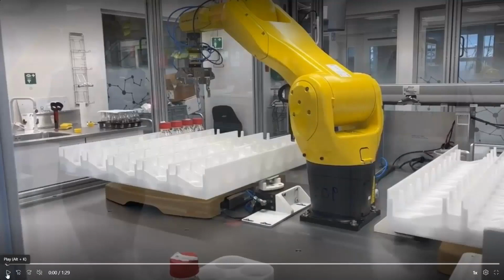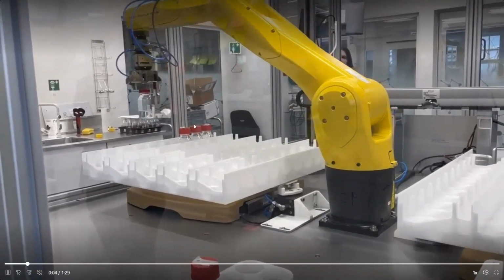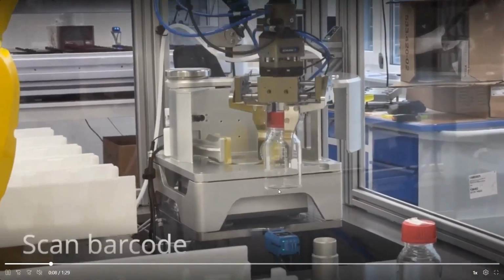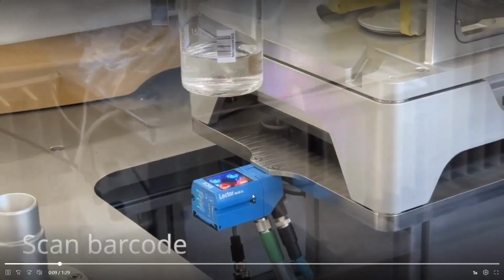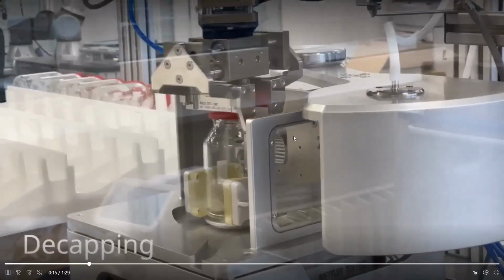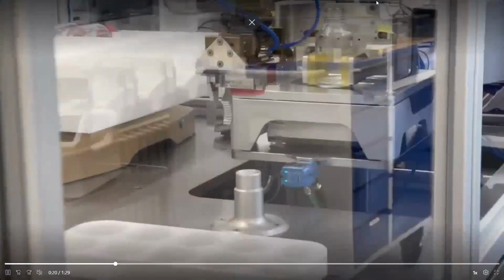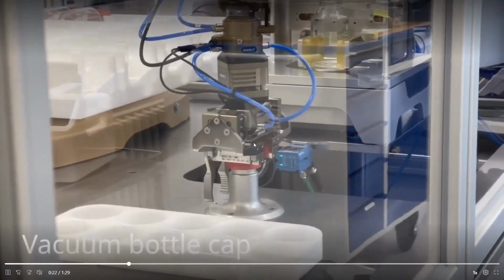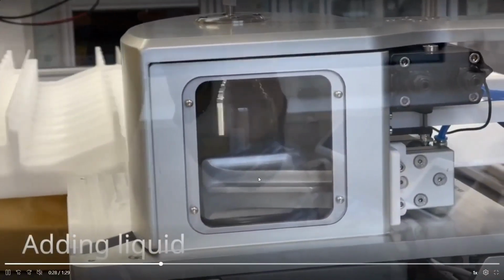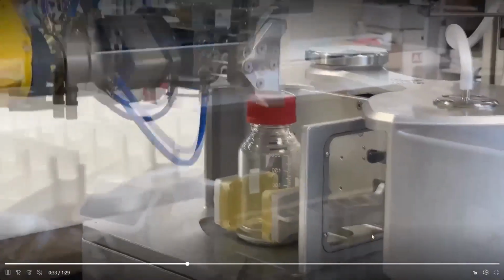So there's a lot going on, but these are our samples in the bottles, and this is the balance where it's putting them. There's a scanner reading the ID of the bottle below. Then there's a scanner on top, that maybe you cannot see right now, reading the sample identifier that was on the cap. And now the balance is taking the measurement. It's a Mettler-Toledo balance.